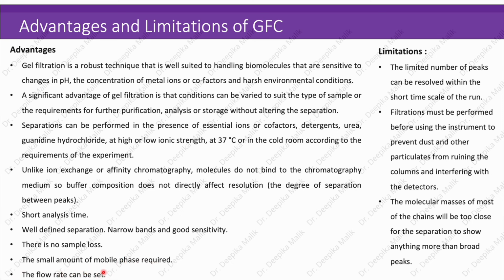Limitations include that only a limited number of peaks can be resolved within the short time scale of the run. Filtration must be performed before using the instrument to prevent dust and other particulates from clogging the columns and interfering with the detectors. The molecular masses of most of the chains will be too close for the separation to show anything more than broad peaks. That is, if the molecules which are to be separated have similar molecular weights, the chromatogram will show broad peaks.